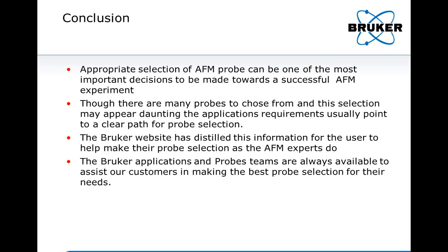I'll start with some of the questions that came in earlier, more on the AFM or general questions, and then fairly quickly move into the specific applications. Okay, so in general, at the start you said that tips with higher resonant frequencies are better. We had some interest in why you said that. We did not get into this in detail in this presentation because we were trying to take it from the probe's perspective. In short, higher frequency probes are typically lower noise because the thermal noise is spread over the entire bandwidth to the first resonance, and they're typically faster.